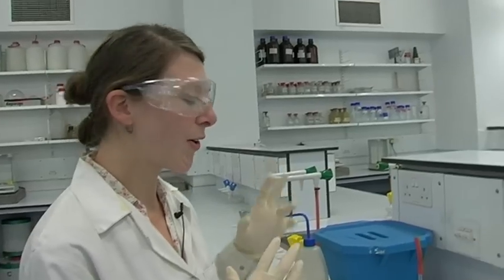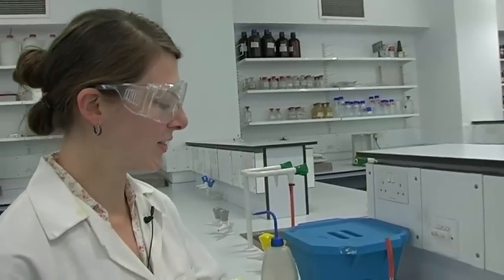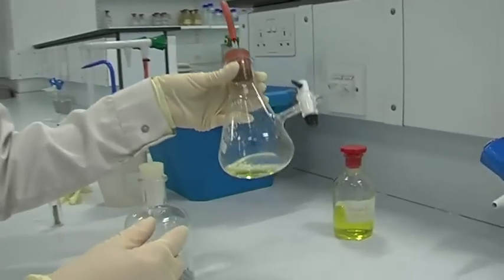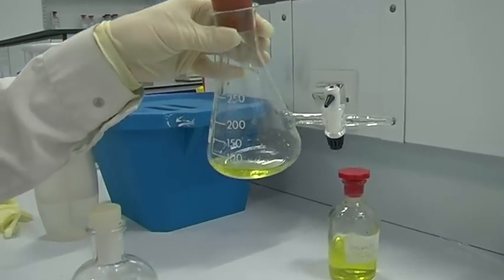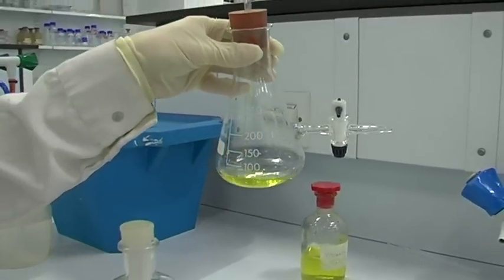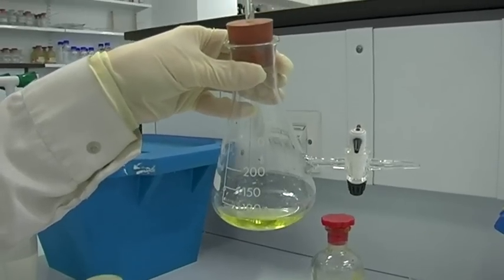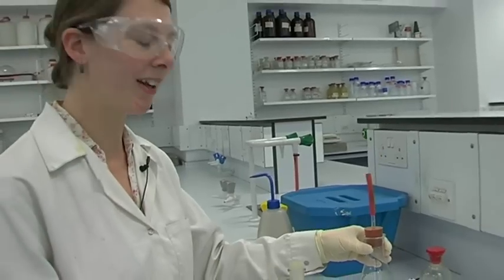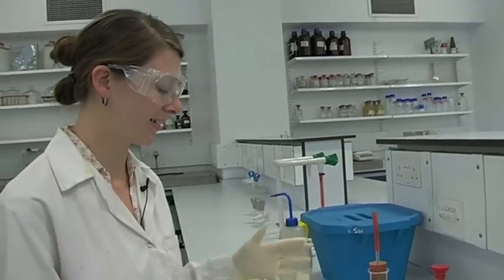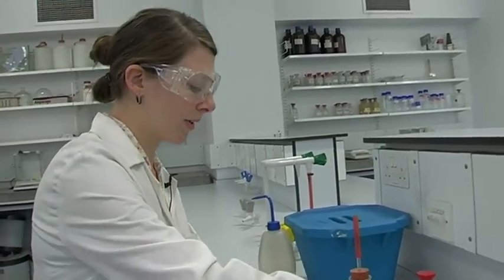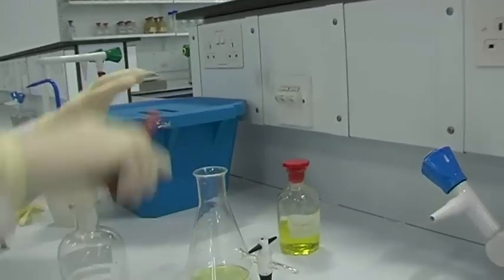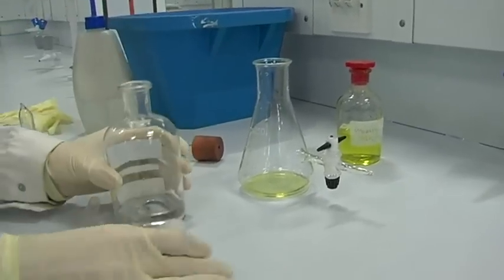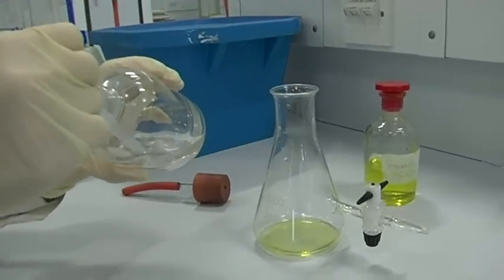I'm going to try and do a whole series of oxidation state changes with vanadium, which is in the 5 plus oxidation state here and is a yellow color. Vanadium gets its name from the Norse goddess of beauty, and that's partly because of the range of differently colored oxidation states which it can exhibit. So I'm going to add some zinc amalgam to this, which is our reducing agent.